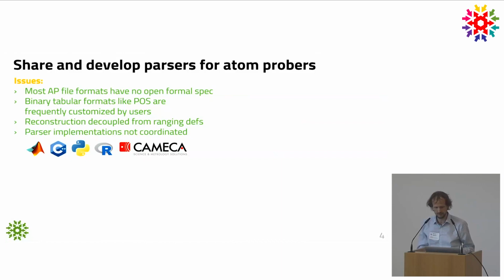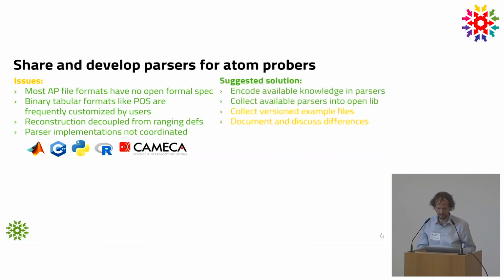So what we immediately decided in the project is we said, well, all of our parsers that we're developing for NOMAD, we basically bring out in a dual role. They are put in a Python library, and they are immediately brought to the community that the community can use them for whatever they want to do. If they write Python tools, they can use it. But also we use these tools to parse data inside NOMAD Oasis. So we call this library also inside NOMAD Oasis.